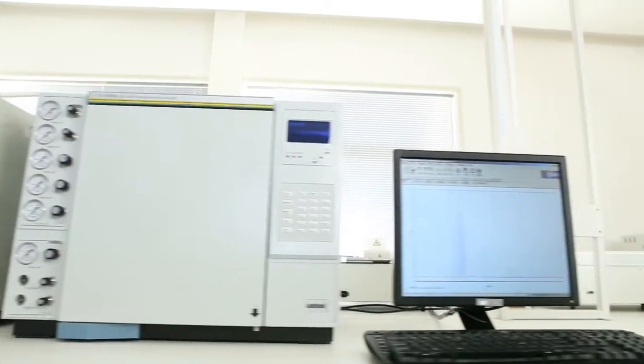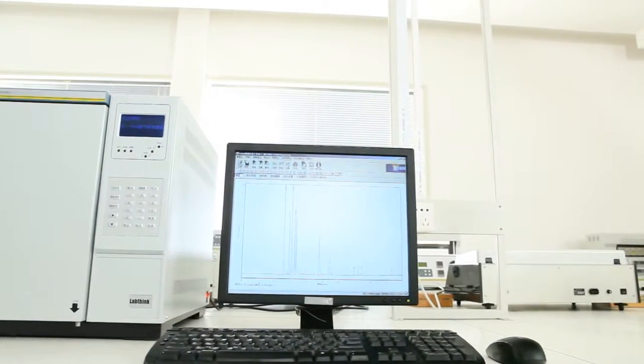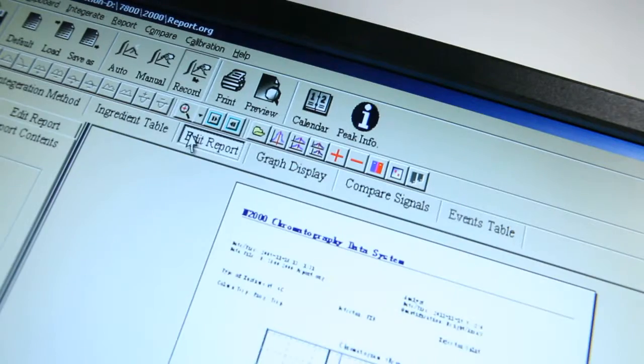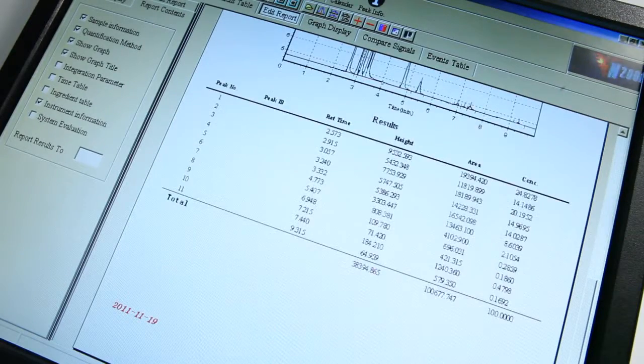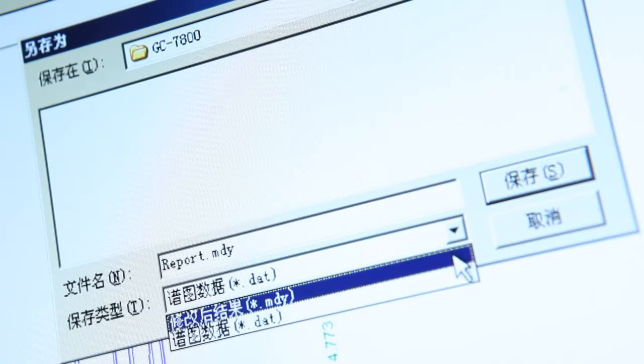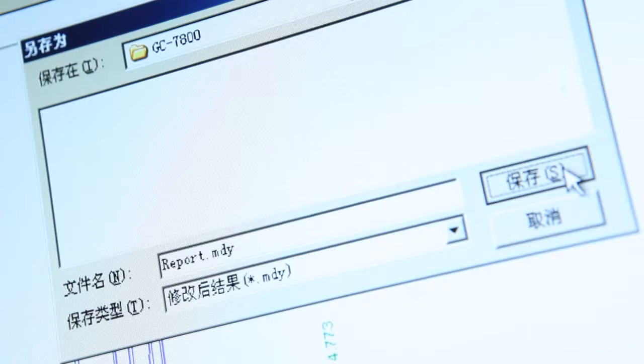The professional gas chromatography software equipped with this instrument provides powerful data reanalysis and reprocessing functions. The multi-format report exporting function makes the sharing of test data easier and more convenient.